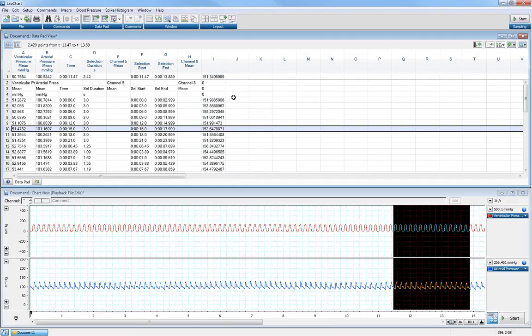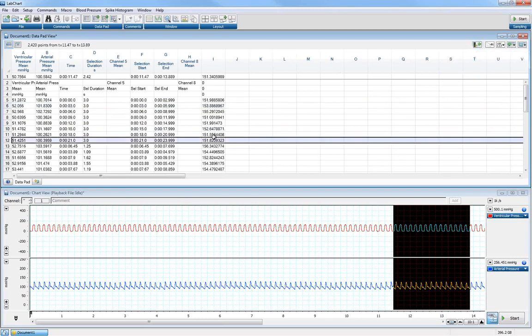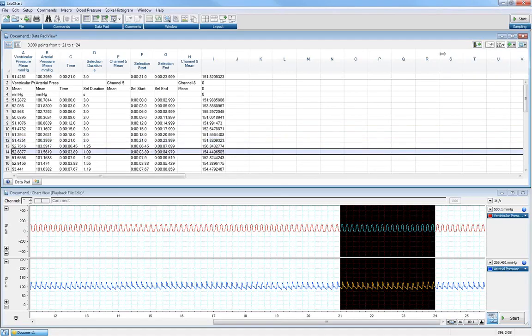and it again will recalculate based on that particular formula that you put up the top there. Okay. And there's a few other buttons on the right-hand side over here. These are basically shortcuts for what I've shown you before. So again, if I select a row and click on this button here, it'll go back to that selection in the chart view, which corresponds to that particular row.